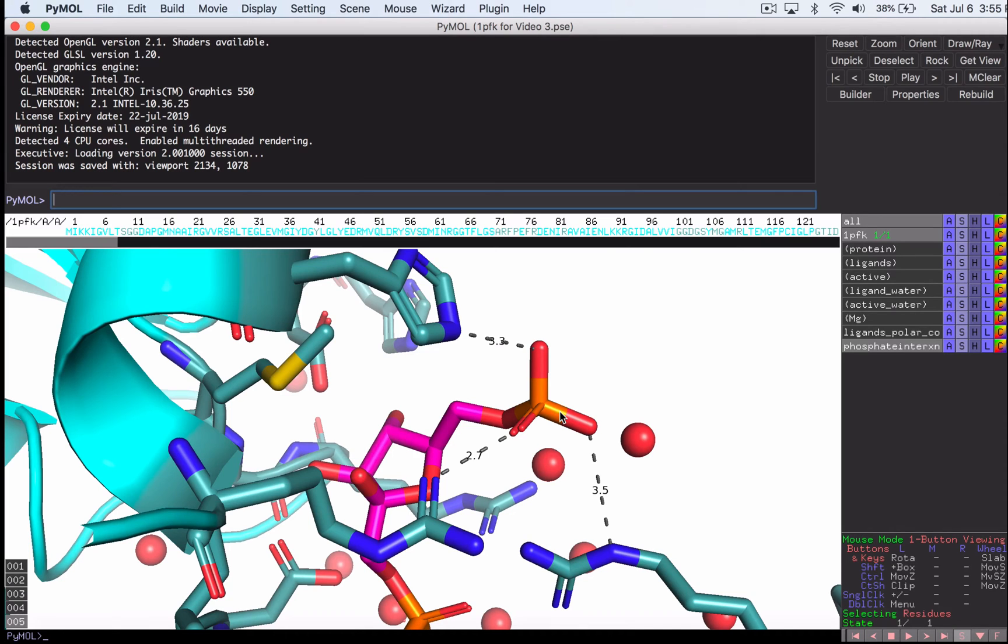In the previous video, we left off here. We were showing some interactions of amino acid side chains in an active site to a bound phosphate group, but our labels don't look very good. We can barely see the measurement here because it's obscured by this dash. I'm going to show you how to resize your labels in this video and move them into a better orientation to create publication quality images. Okay, let's begin.